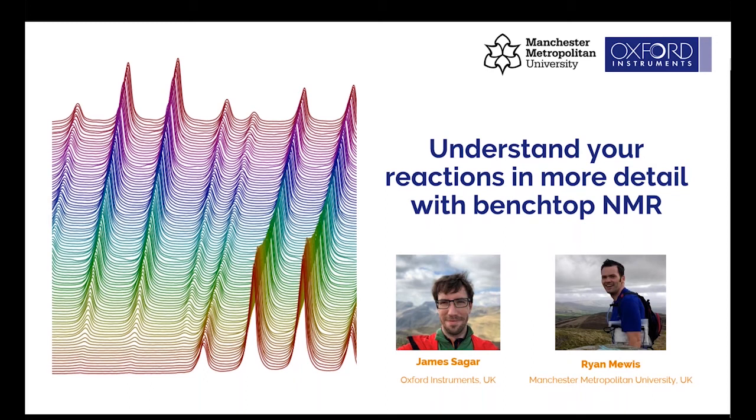Thank you, Ben, for that kind introduction. As Ben said, today we're going to talk about how benchtop NMR can help you understand your reaction chemistry. Initially, I will give you a brief overview of the technology of benchtop NMR, and then I will hand over to Ryan, who will talk through the experiments that he's been doing with flow NMR and monitoring reactions.